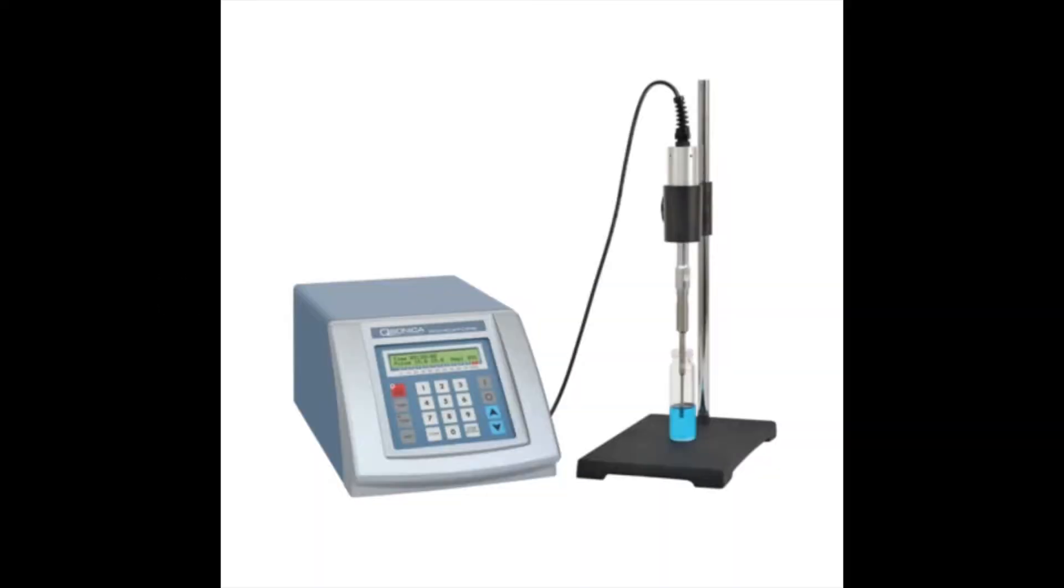This video will demonstrate how to assemble and disassemble the probe to the converter for your Q125 system. It's critical that the probe is properly tightened. If it isn't, the system will not work properly and the components may get damaged.